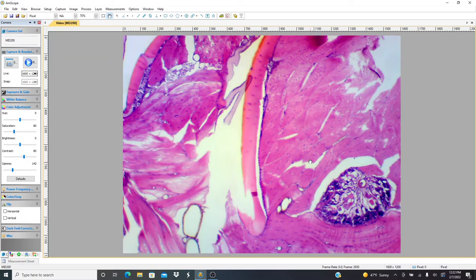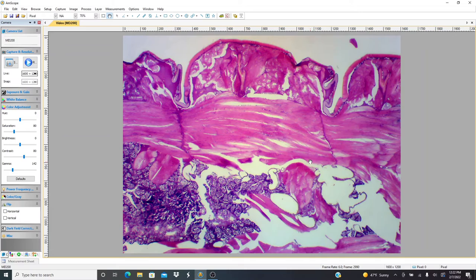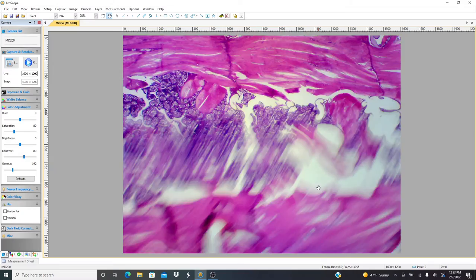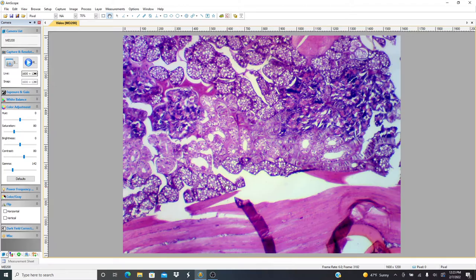Kind of going on really low power, you can see there are these sort of segments that have these structures on the outside, outside of the body. And you've got this muscle layer. So down in here, you get this sort of weird tissue with cells that have this real bubbly look, what we would call in pathology bubbly cytoplasm. Here's some glands, these sort of empty structures lined by these flat cells. Those are glands. Of course, I don't have any idea what they do, but they're there.